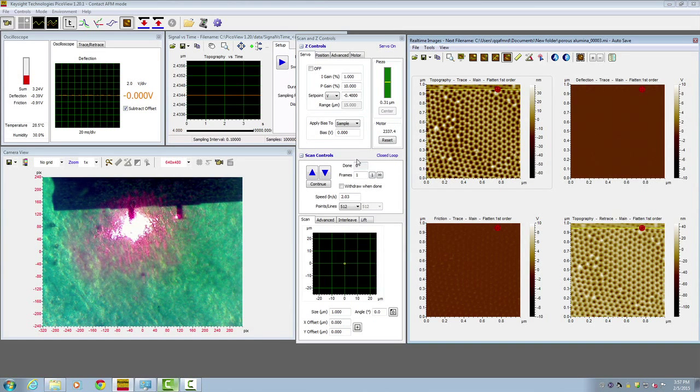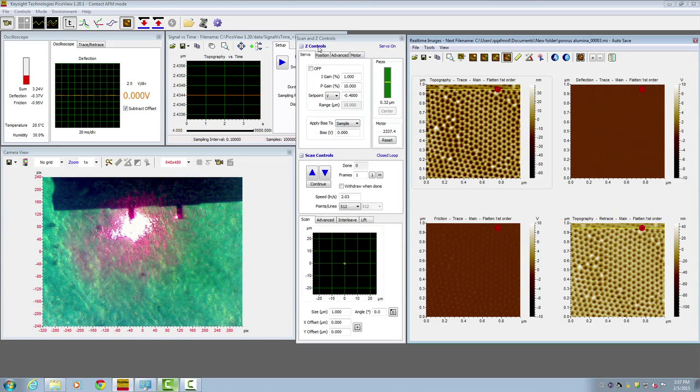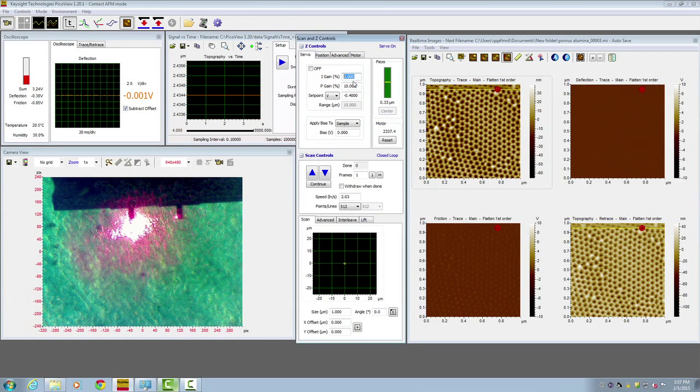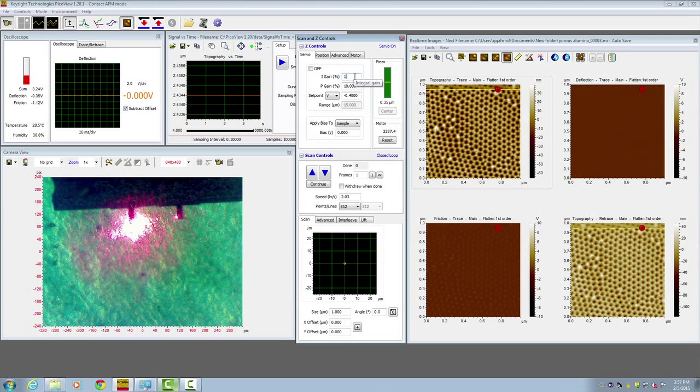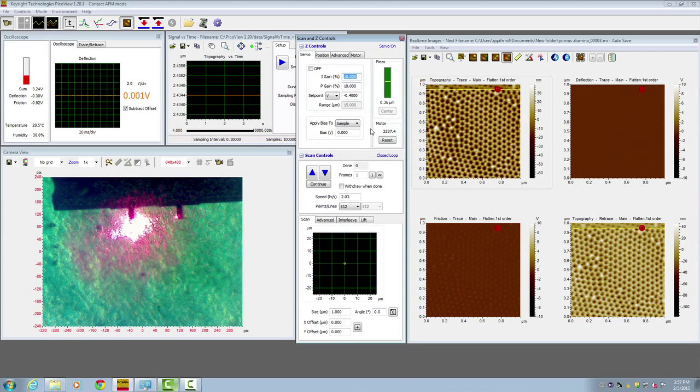The next thing is to optimize the integral gain. Go back to the Z control, the servo control. Start with an integral gain of about 10, and now we're ready to scan.